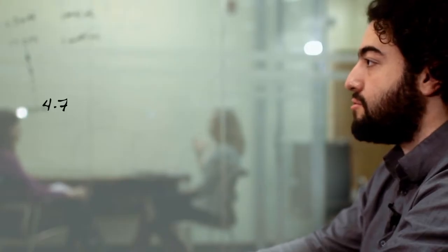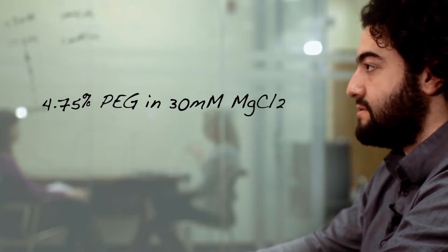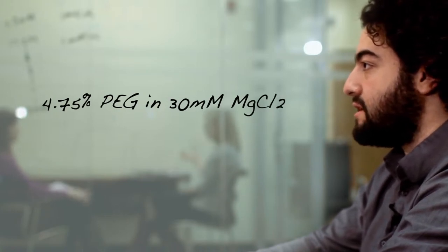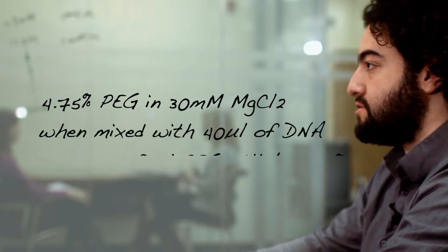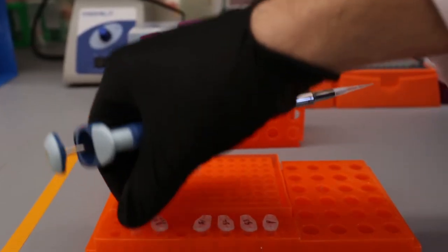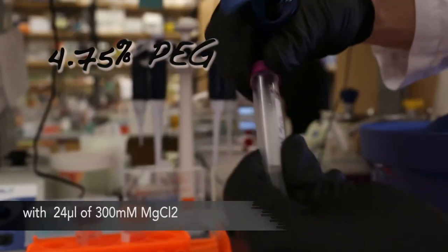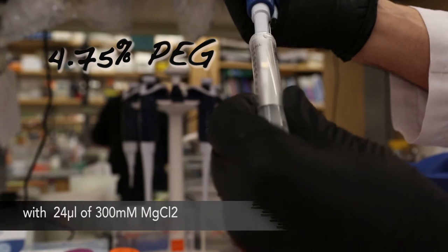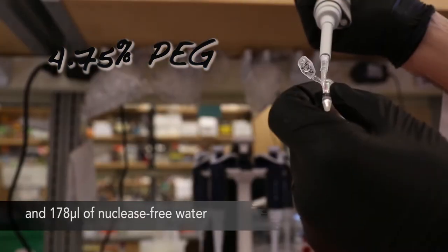First, we make a 4.75% PEG in 30 millimolar magnesium chloride. This is at a higher concentration than we want, so that when mixed with the 40 microliters of DNA, the final PEG concentration will be roughly 3.5%. To make this PEG solution, mix the following: 38 microliters of 30% PEG stock, 24 microliters of 300 millimolar magnesium chloride, and 178 microliters of nuclease-free water.